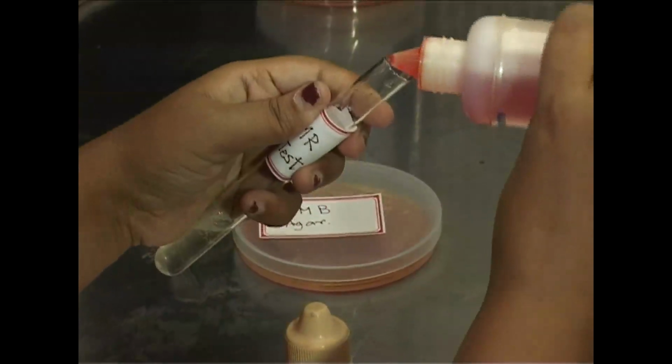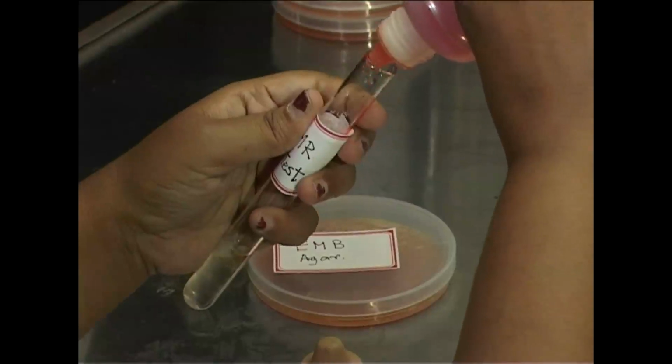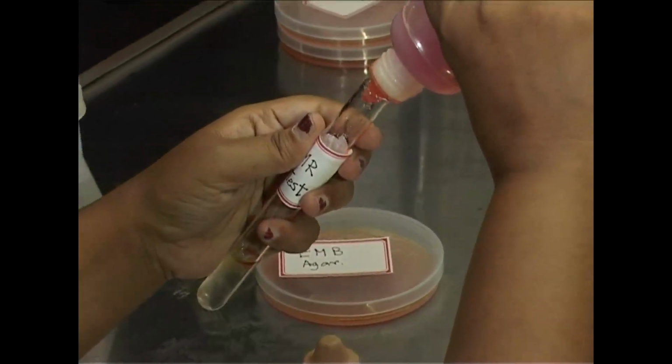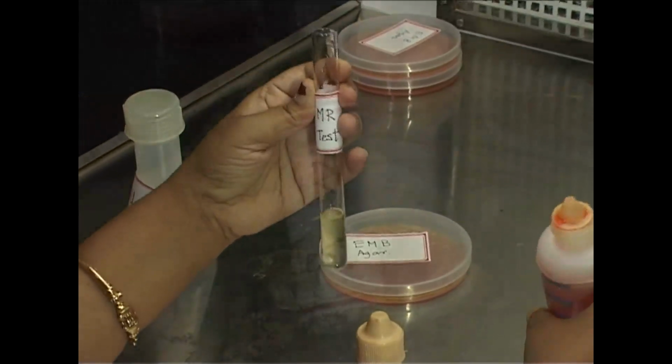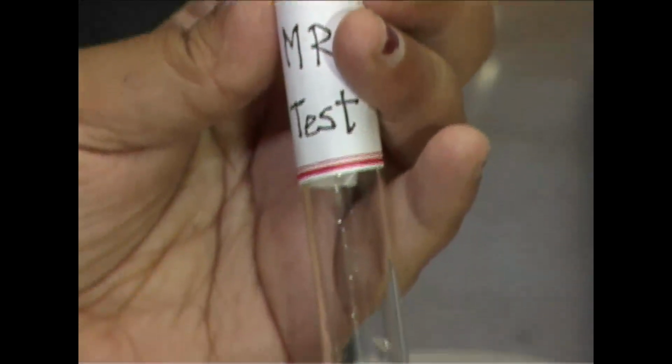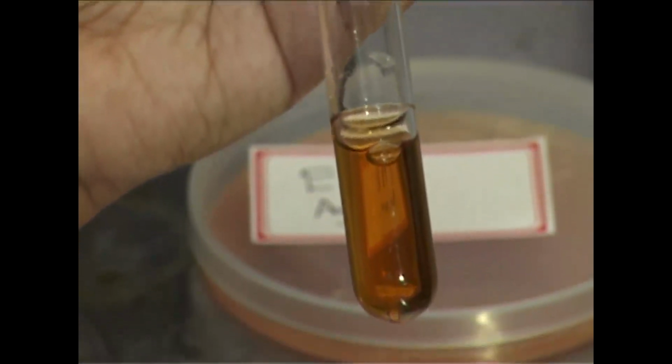Within 5 ml of methyl red Voges-Proskauer broth, you have to inoculate the collected sample, and 5 days of incubation time will be given. After that, 5 drops of methyl red indicator will be added. As we know, E. coli follows the mixed acid fermentation pathway, so they will produce enough acid. The pH will be lowered to pH 4, so the color of the methyl red will be red, showing the positive result.